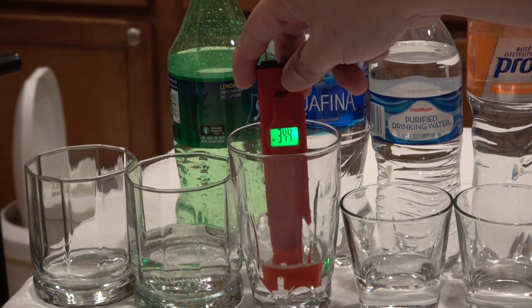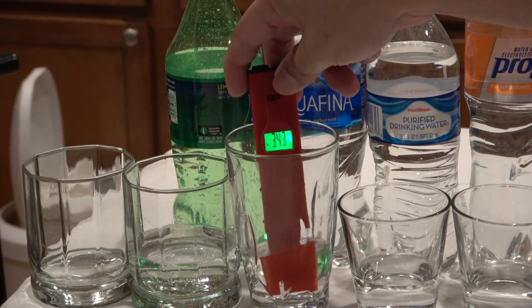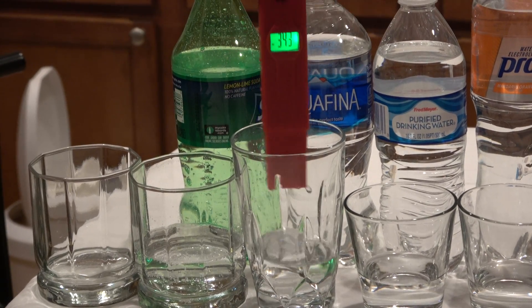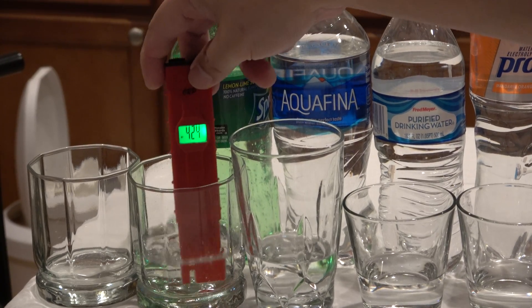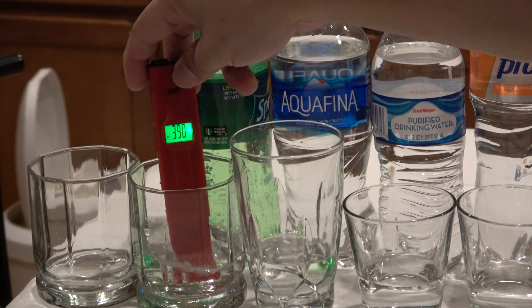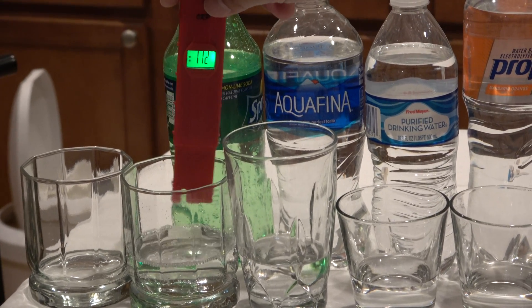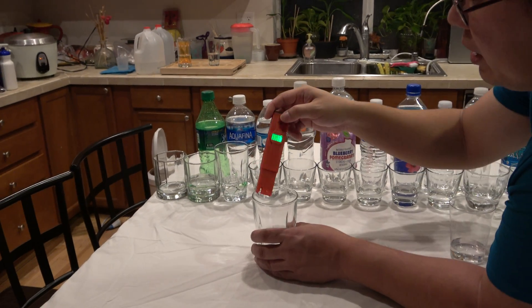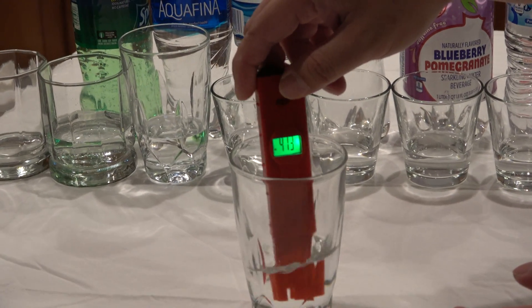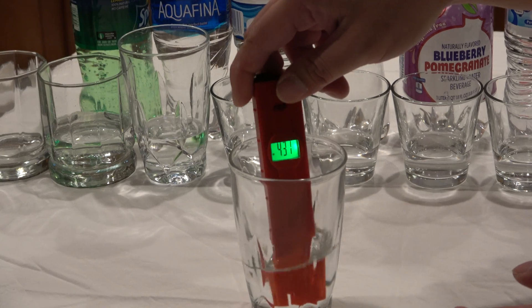The Aquafina is about positive 343, 345, 346. Sprite is about positive 390. And this one is the tap water here in Kent, Washington — this one is about positive 430.